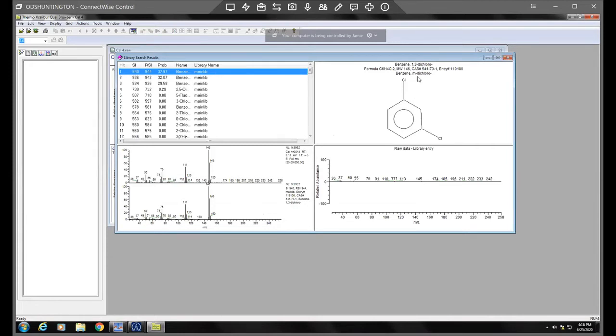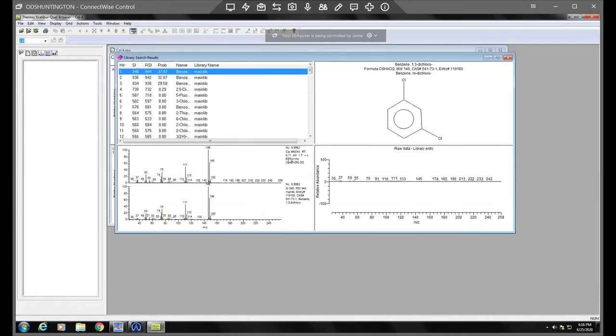So here we've got one, three dichlorobenzene. The way you would kind of use this, so look at this first. So this is your sample. This is our CALFOR sample and here's our main library. So it's the comparison of the two spectra.